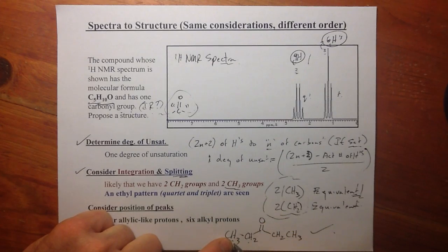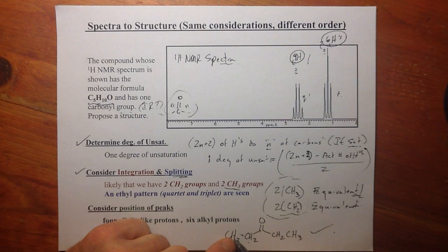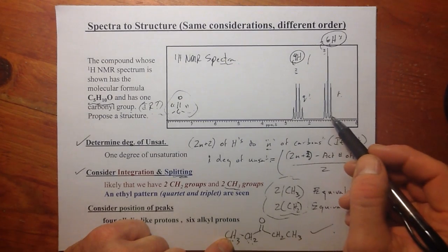So if you think you have something going on for these 3 protons and you just want to know their splitting, you don't grab them. You go and find their neighbor. So let's take, out of these 6, a representative, so I'll just grab one of those and take a walk. I take a walk over here, I have 2 protons. 2 protons as neighbors, it's an n+1 rule. I'm expecting a triplet for this signal. So of course we see that, we see a triplet.